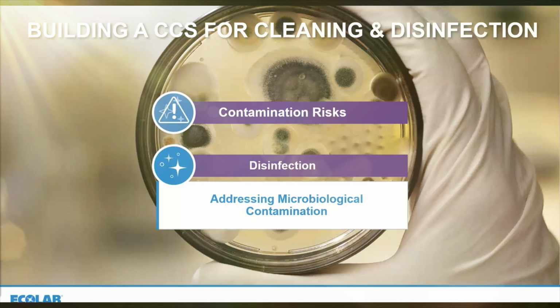So we're talking about the organisms that are potentially shed from humans, so your staphylococci, that kind of thing, or it could also be more spore-based ones, fungal or bacillus spores potentially entering the facility, and also possibilities of waterborne sources that maybe if you use water within your facility. So again, it's just thinking about all those different elements of where those microorganisms might be present within your facility based on how you perform operations, and then you can design that disinfection step to treat those potential presence of bioburden.